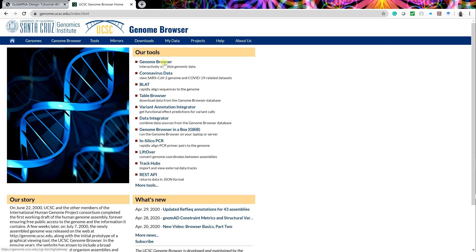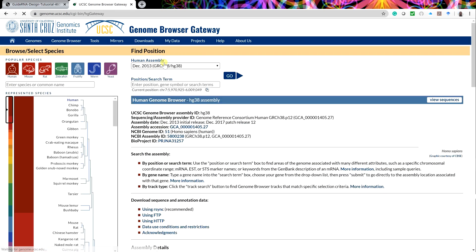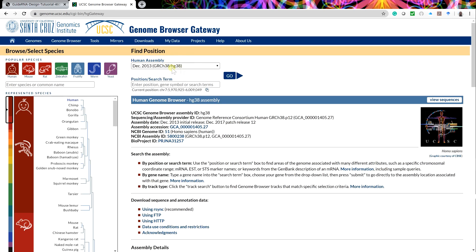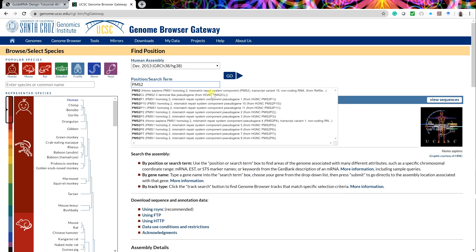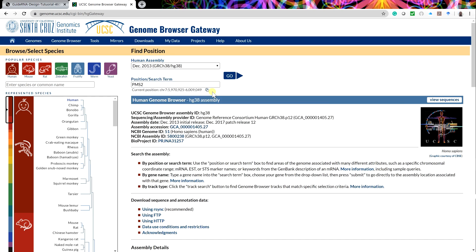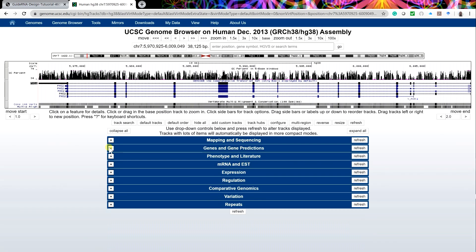Select the genome browser link. Select the most recent human reference assembly from 2013. For the position search term, enter PMS2, select the top search result, and then press go. The browser will launch and display the 38,125 base pair PMS2 locus.